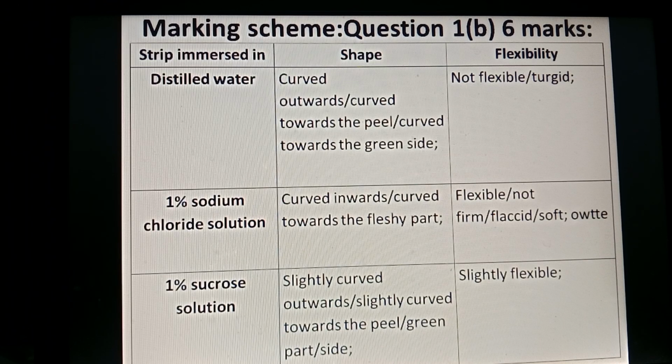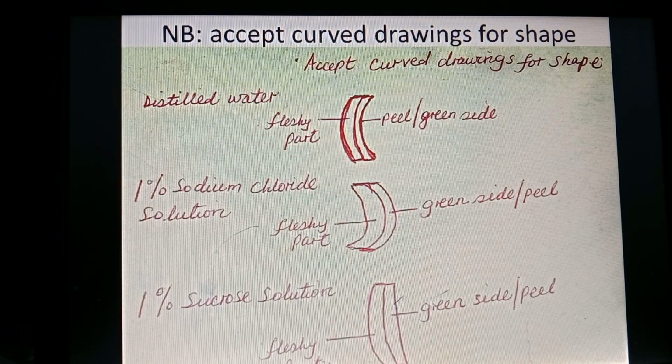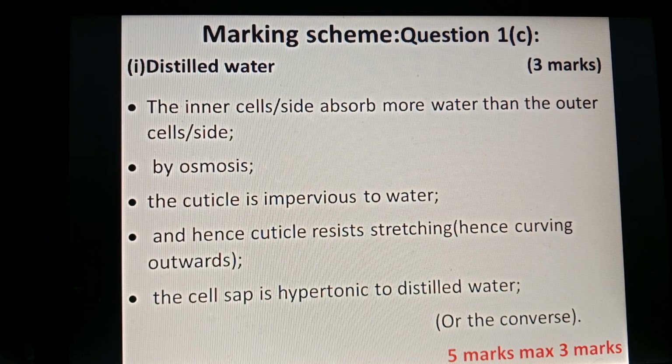Slightly flexible. As simple as that. You could have accepted the shapes. For the shapes, you could have accepted the drawings given here. In distilled water, you can see the shape of the drawing. In 1% sodium chloride, you can see the shape, and in 1% sucrose solution.